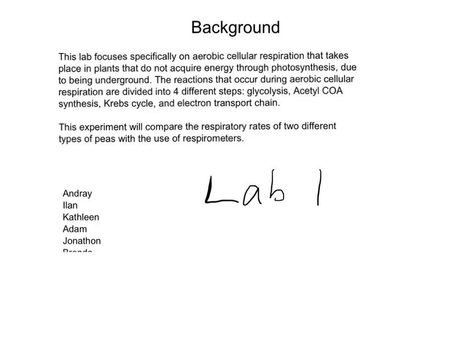The primary purpose of this experiment is comparing the respiratory rates of 2 different types of peas that we use throughout respirometers. So basically we're learning about respiration, and we're comparing 2 different types of samples to see which respires more.